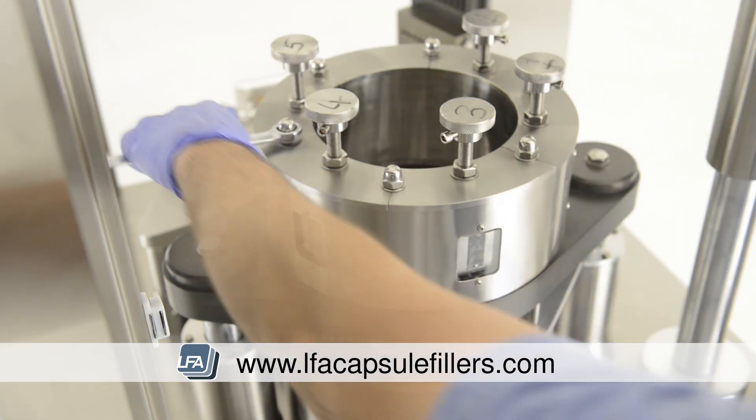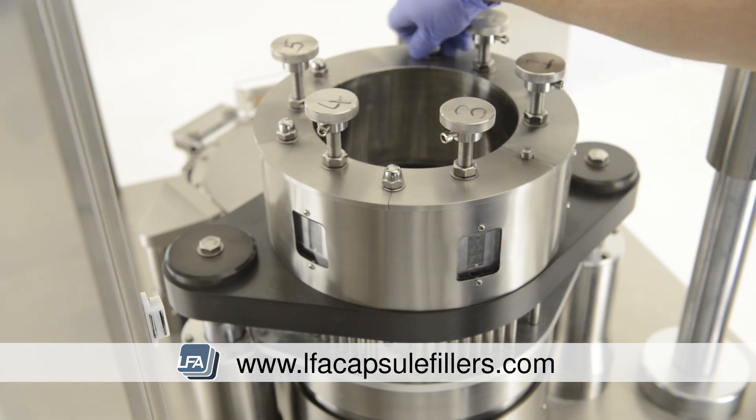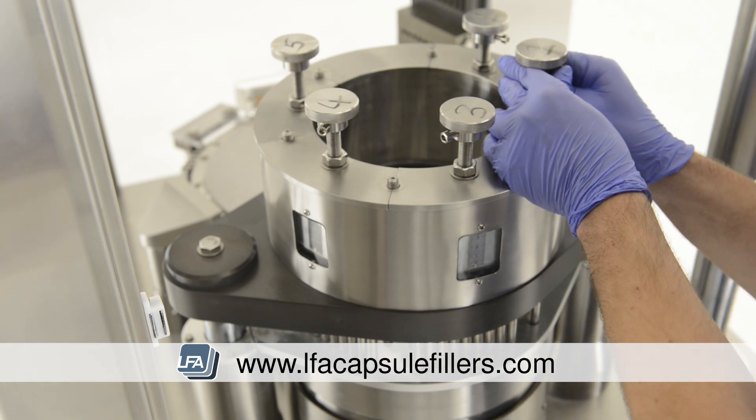The next important step is to number the stations — this is to assist us when we're replacing our tooling. Take your spanner and remove the nuts and washers around the top section of the tamping turret. We're then able to remove the tamping tooling, which can be done in any order.